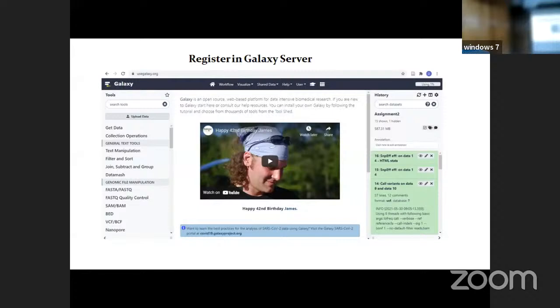Rather, you would like to work on your own server, which is confined to you, because you have spent crores of money, and you would not give data to a server in some foreign country. Before you publish, they may publish. You never know. Nothing against it. This is a very good starting point, but I would suggest if you are working with original data, work with command line, Linux. It will be pretty fast, and once you get used to it, it will be quite useful for you also.